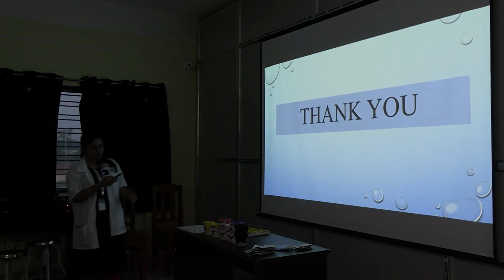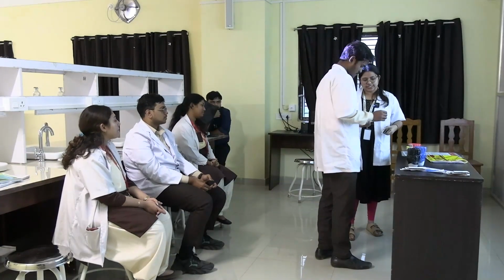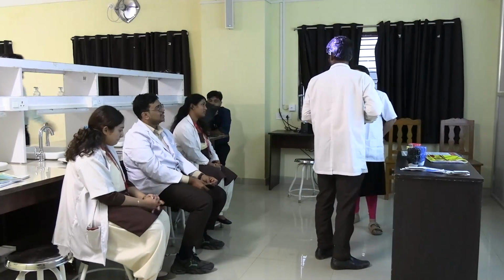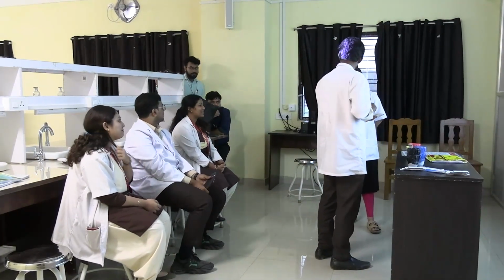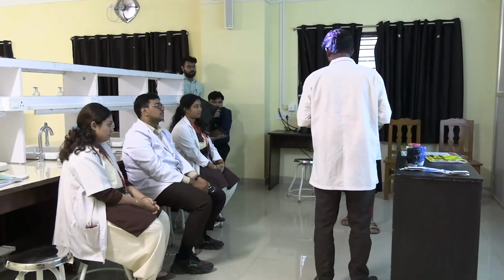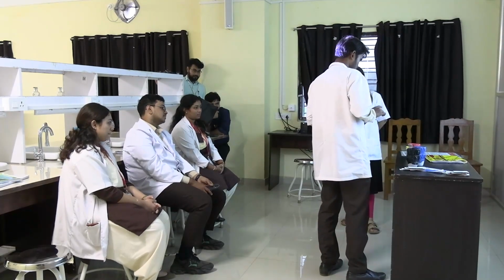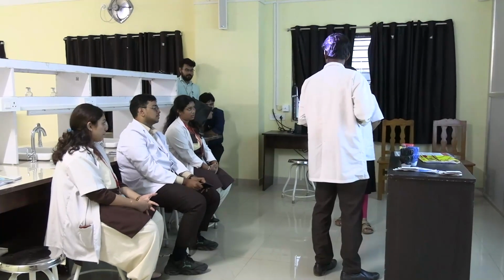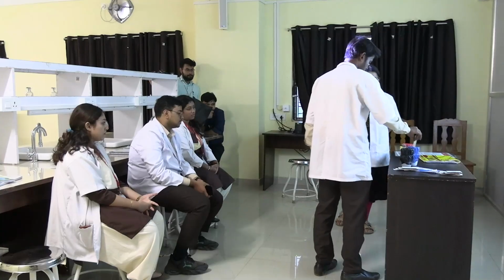Expired injection vial. Say the name of the waste loudly so that your friends can also hear. Expired injection vial. Where will you throw it? What is the vial made of? Sir, glass. So glass in which container? It's blue. Throw it in.